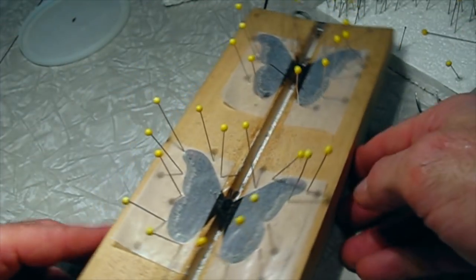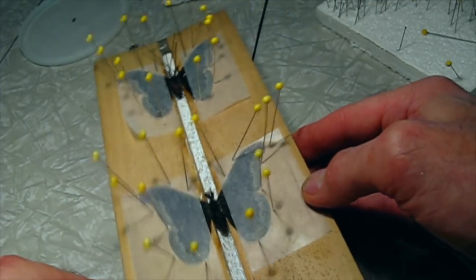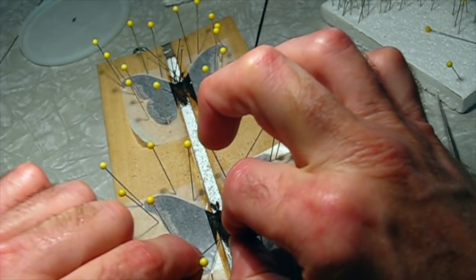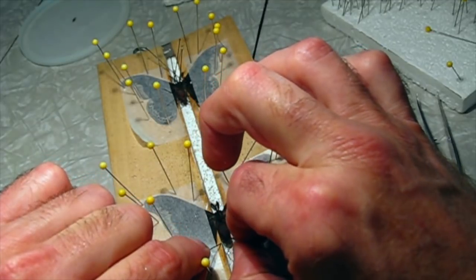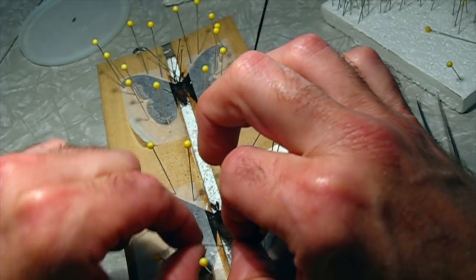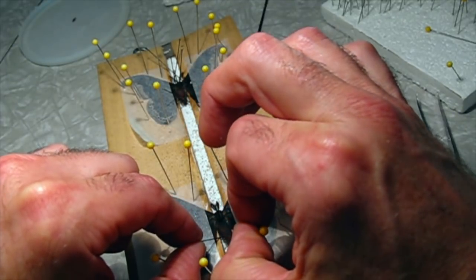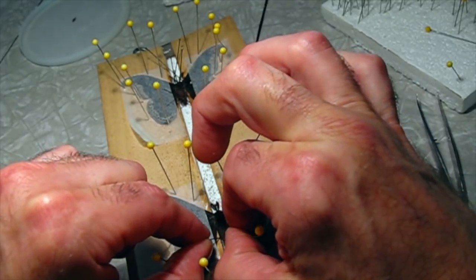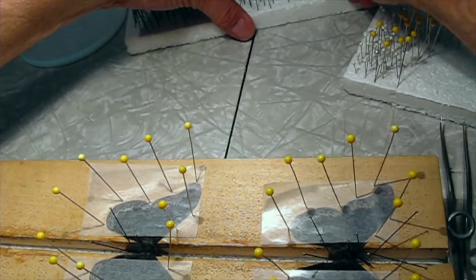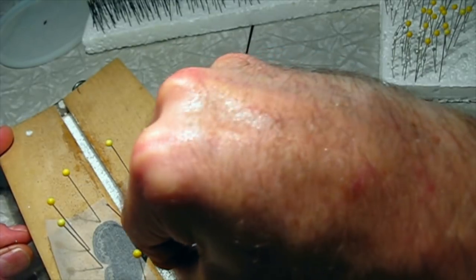We'll check for symmetry — yeah, that looks really good. Then we'll take a couple of pins and raise the abdomen with a little brace. All of this gets much, much easier with practice. When you do this for the first few times you can feel like a complete klutz — trust me, we all did. But after you've pinned up a bunch of them, it gets to be very, very easy.